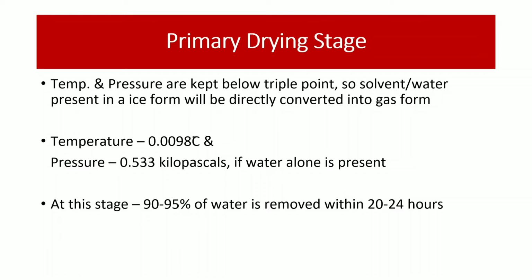So at this stage, at the primary drying stage, 90 to 95% of water will be removed. And the time duration taken to remove this 90 to 95% water at the primary drying stage is 20 to 24 hours.